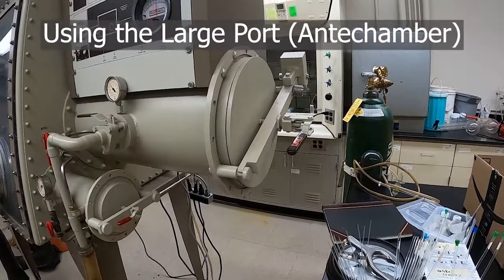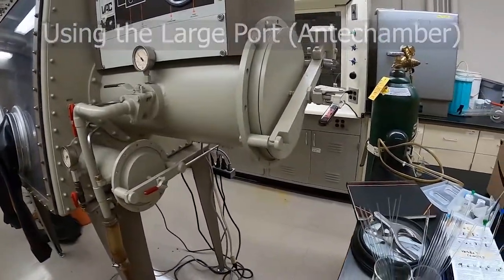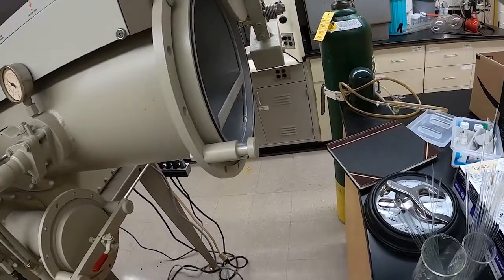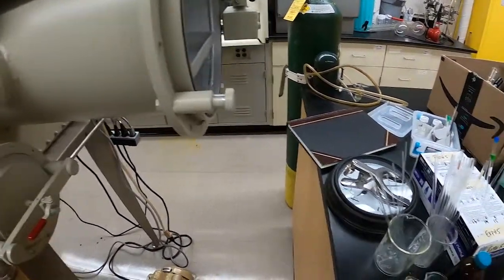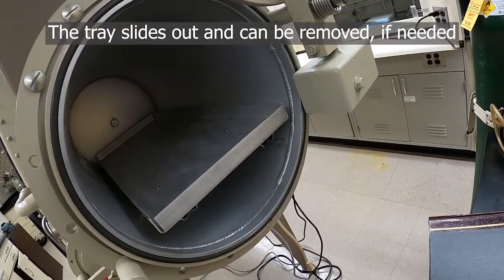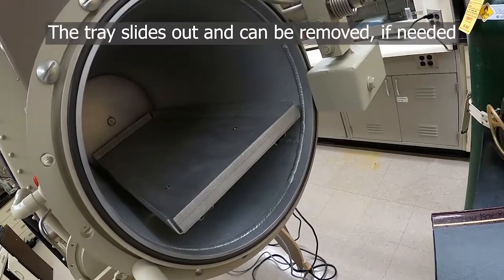If you need to bring in a large amount of supplies at one time, or objects that don't fit through the small port, you can use the large port of the glove box. It has a counterweighted door and also a tray. The tray can be removed if needed if an object you're bringing in is too large to fit with the tray still in there.